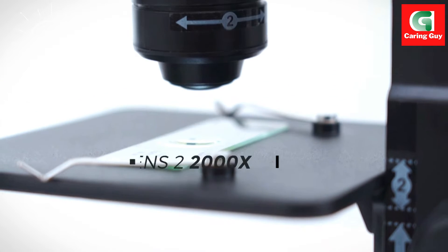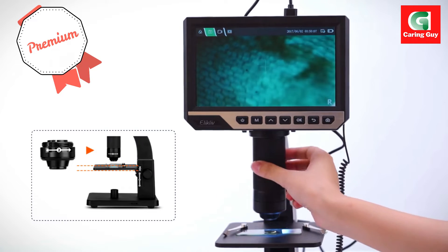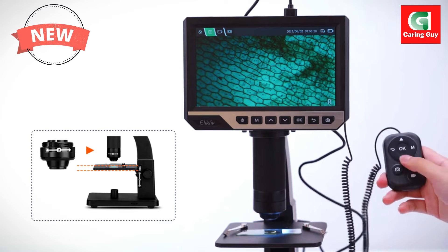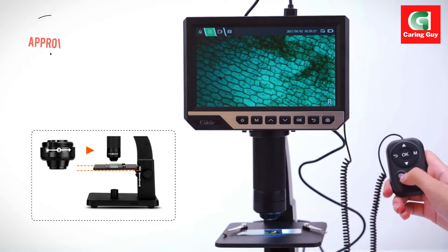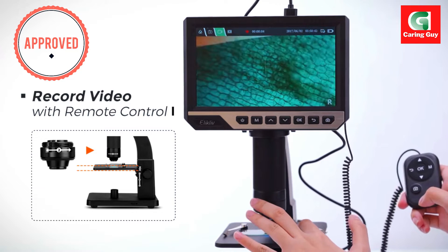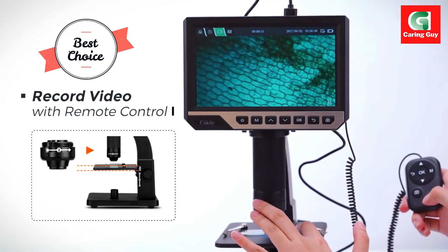The microscope is equipped with a 50-500X range digital lens, referred to as Lens 1, enabling users to observe macroscopic objects in detail. This includes examining error coins, printed circuit boards, insects, and plants with precision.